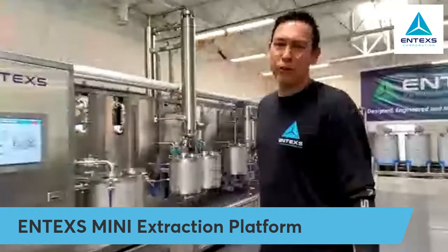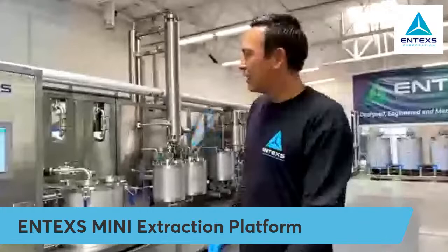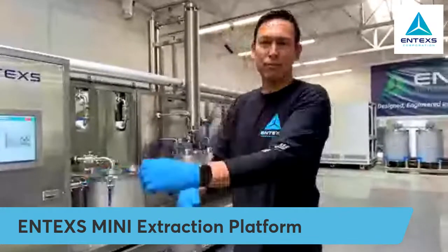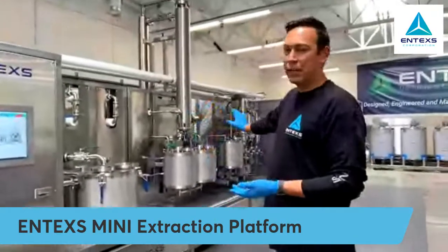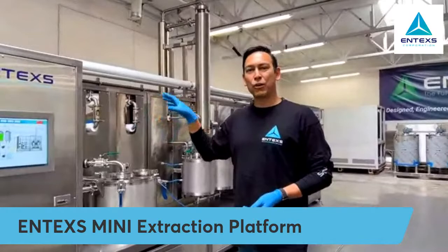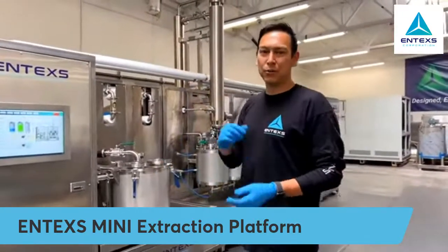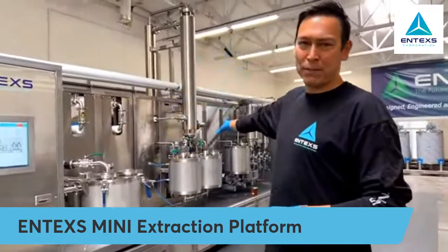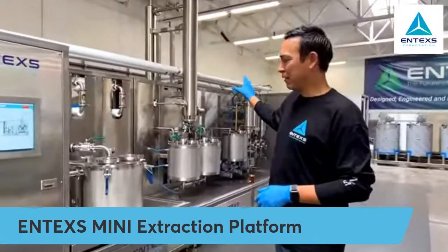Thanks again for joining. I apologize for any background noise — we're in our shop here, so there's some fabrication noise in the background. In summary, this is our mini-nine processing system. I'm going to walk through this. It's a processing system that goes from hemp or biomass input to a crude indoor distillate final product. We have the extraction system, the EVAP system, the desolve unit, and the distillation unit on this piece of equipment as well.